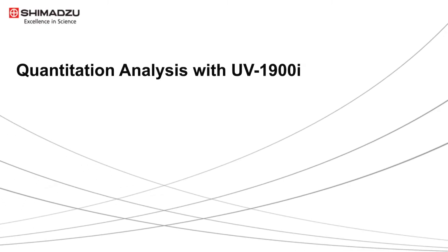In this video, we will go through the standalone operation on quantitation mode for UV-1900i.